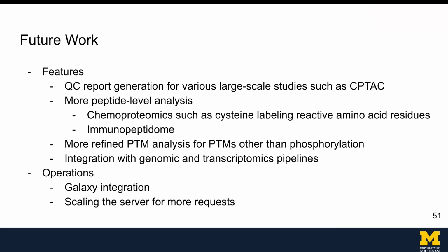And which labs have made the most special, new uses of the FragPipe pipeline? Do you mean FragPipe-Analyst or FragPipe? FragPipe pipeline, yeah. In my understanding, I would say probably the chemical proteomics field. That's why I did some peptide-level analysis, like cysteine-level analysis of reactive amino acid residues.